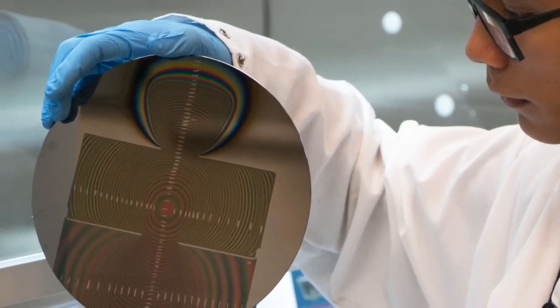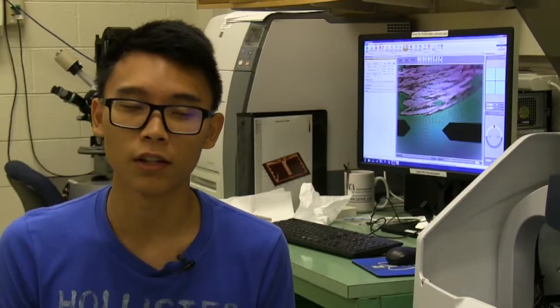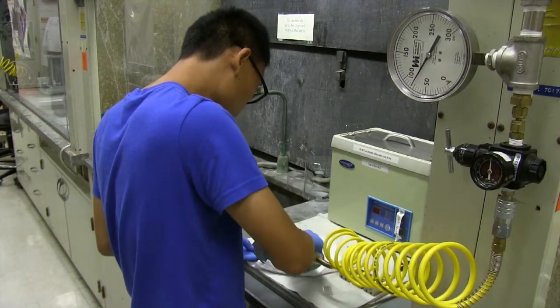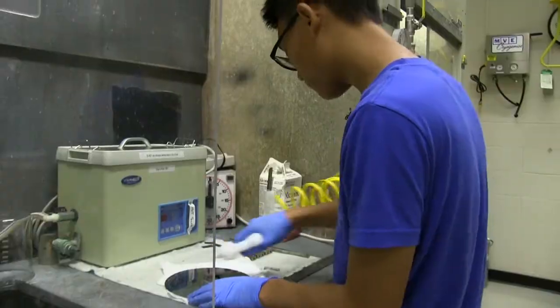We have two different materials. One is GSS, which is germanium antimony sulfur, and the other is GSSE, which is germanium antimony selenium. They're both known as chalcogenides and they're known for their nonlinear optical properties.